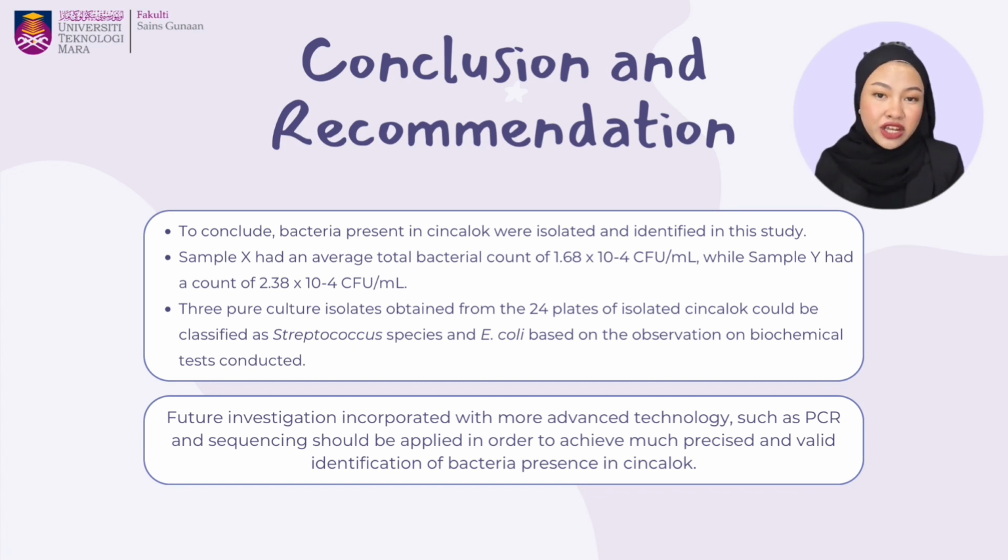Future investigation incorporated with more advanced technologies such as PCR and sequencing should be applied in order to achieve much more precise and valid identification of bacteria present in the Cincalok.